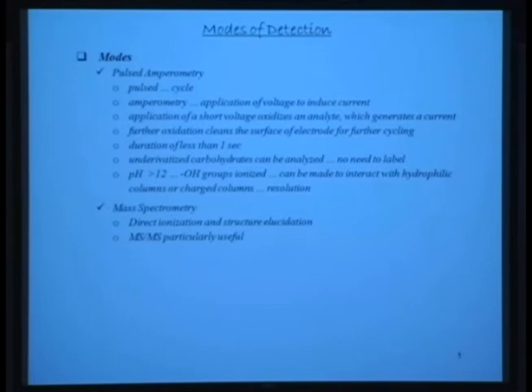And the final major detection technique in use today is mass spectrometry. There are several ionization protocols. This is absolutely useful for structure elucidation, and with the advent of tandem MS, you can actually do sequencing of every peak that is eluting.